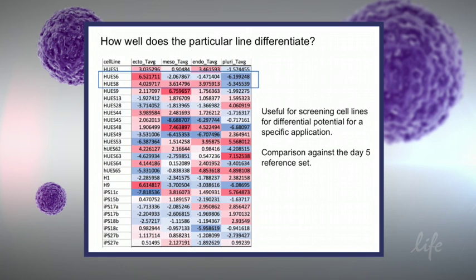And you can see again, across this very large panel of different ES and also iPS lines, within 5 days, you can actually pick up very strong downregulation of the pluripotency genes and upregulation of all 3 ectoderm, mesoderm, and endoderm specification. Now, obviously, on top of that, you could very nicely see that you're inducing these different germ layers.